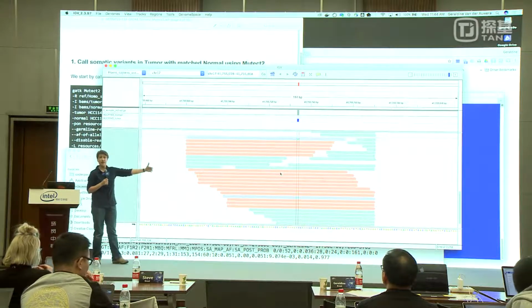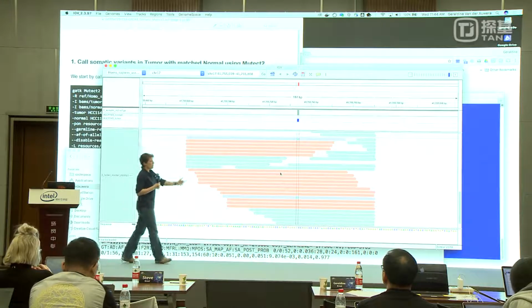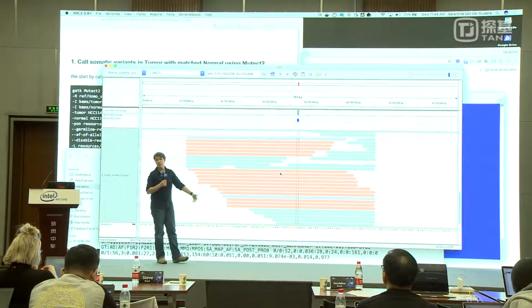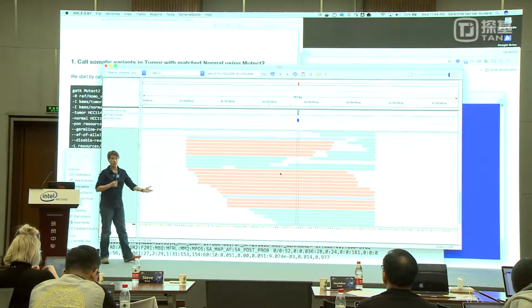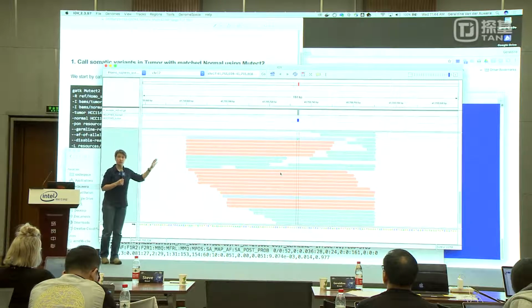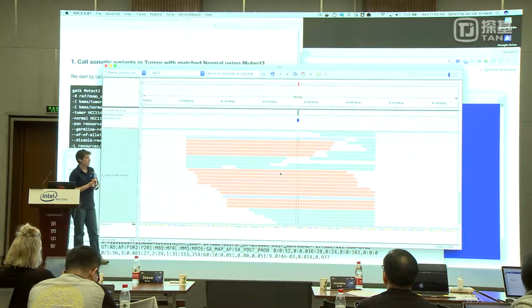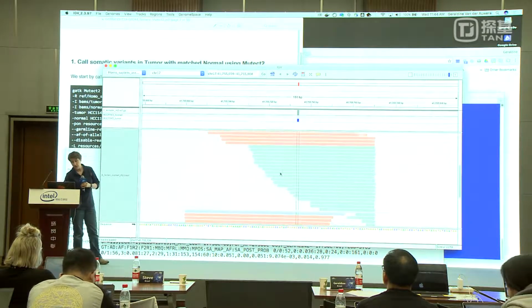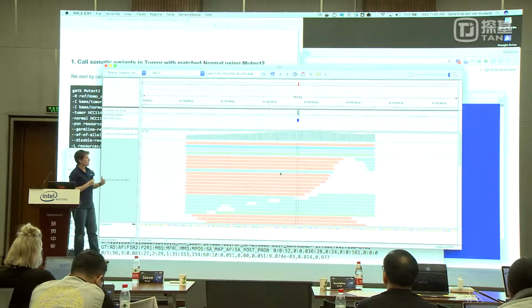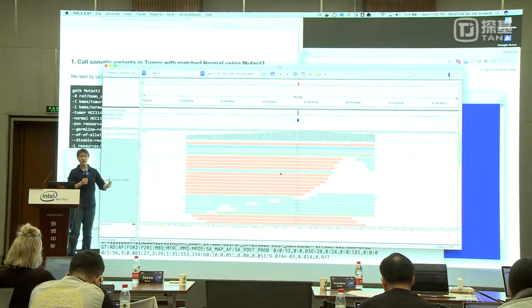And so that kind of thing is what in your Mutect output is potentially part of the false positives that are going to end up there that you might need to filter out. But just in case, we give it to you, just so you don't miss it in case it's real. Okay? So that's how you see the difference between the normal and tumor in IGV in your Mutect output. Okay? For just a randomly selected site.